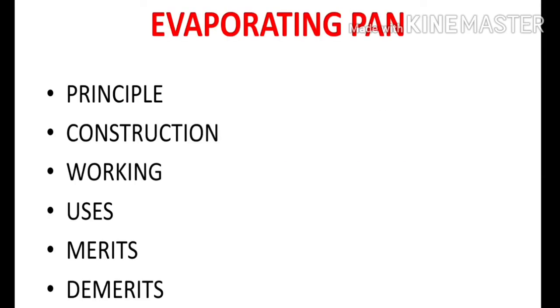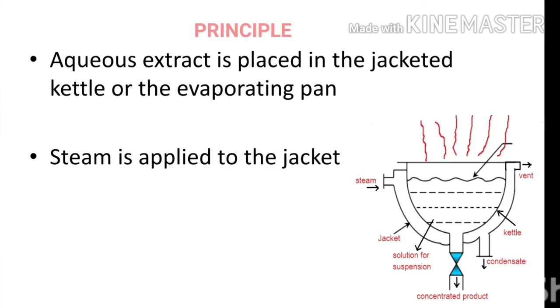We are going to focus on the principle, construction, working, uses, merits and demerits of an evaporating pan. Let's see the principle of steam jacketed kettle.